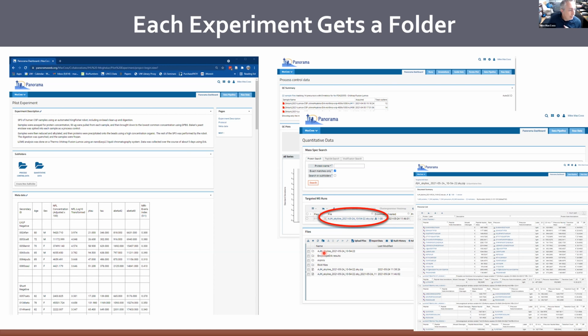I also want to point out briefly that a lot of the metadata currently is just stored as flat information. You can imagine we're very excited about the LabKey Sample Manager, which I think you're going to hear a lot more about tomorrow. We really are desperate to have all of this linked, and I'll show an example of this at the very end, where the data is not stored as flat information in an unorganized manner, but in more of a LIMS-type sample tracking system.